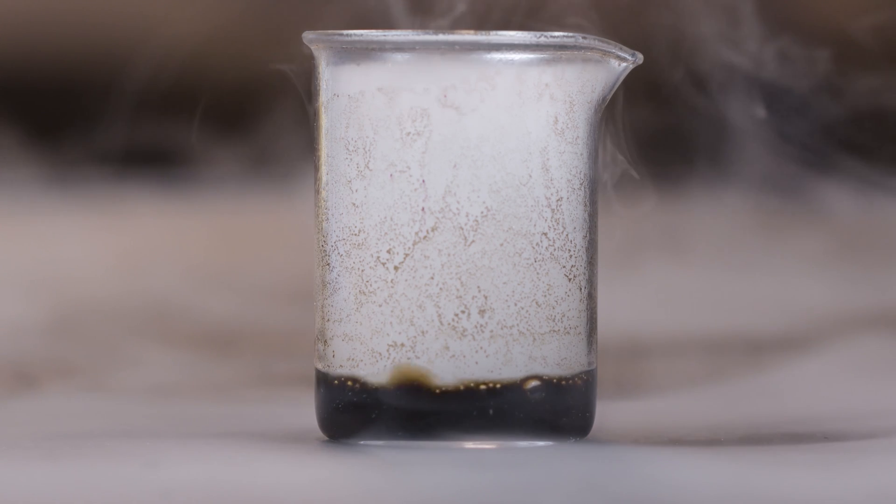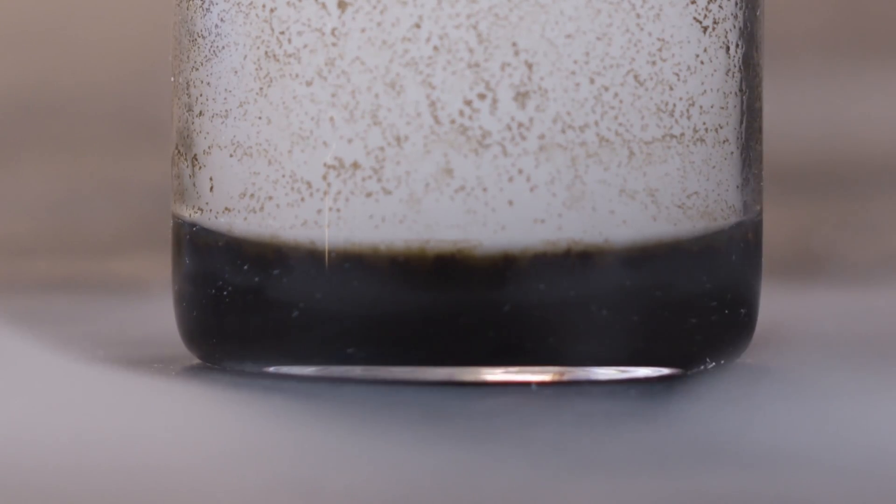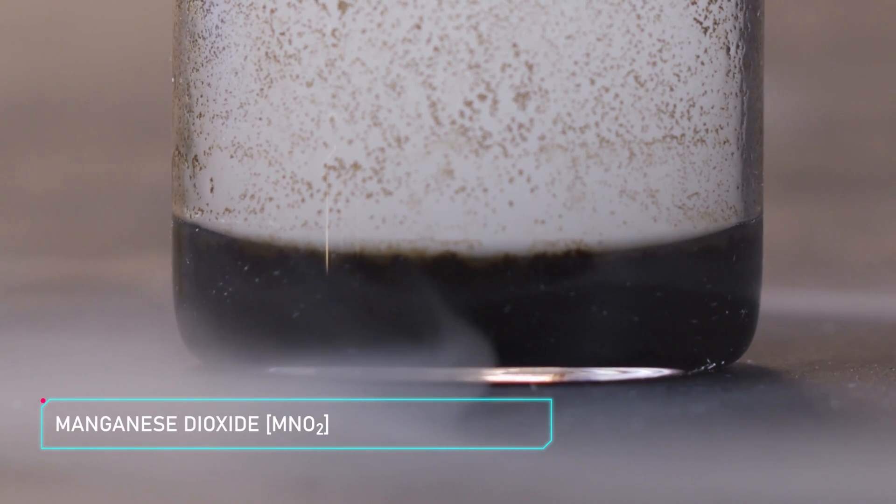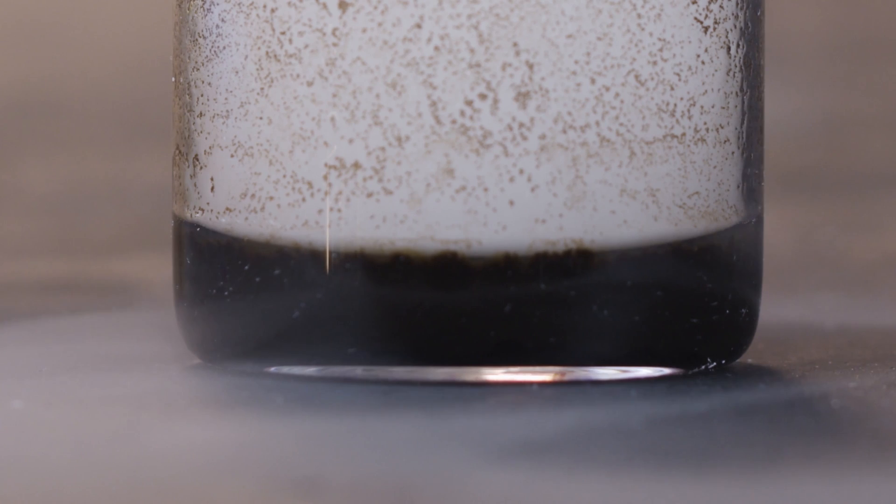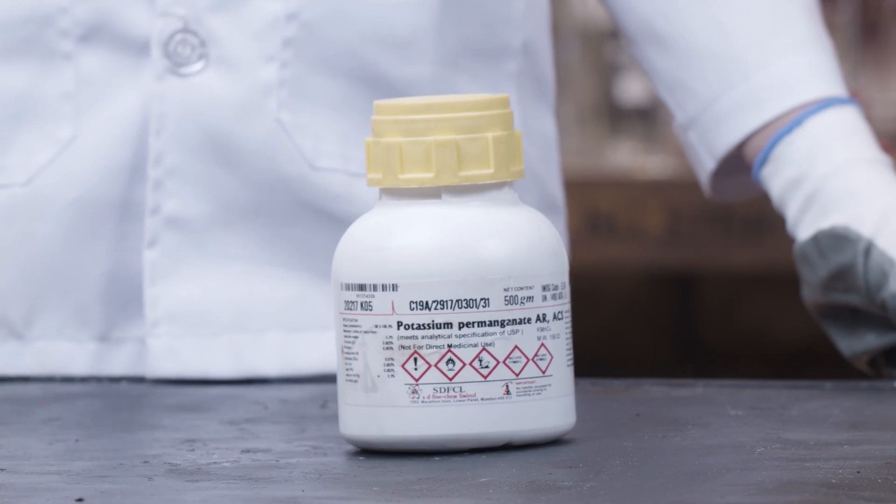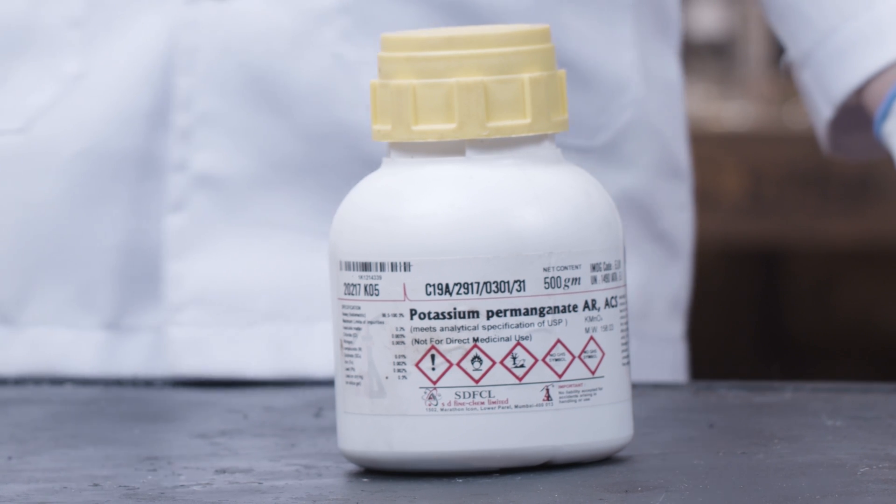So now that the vapor has settled, the black stuff you see at the bottom of the beaker—yep, that is manganese dioxide guys. I literally still have more potassium permanganate and this can mean only one thing. We are just getting this show on the road.